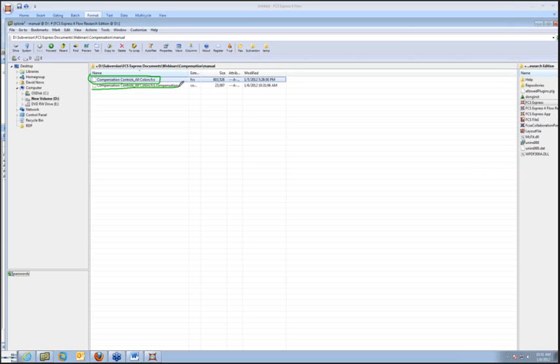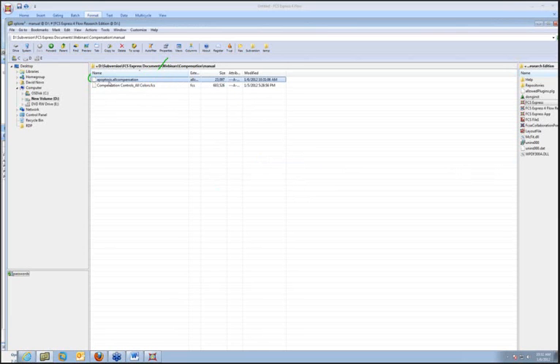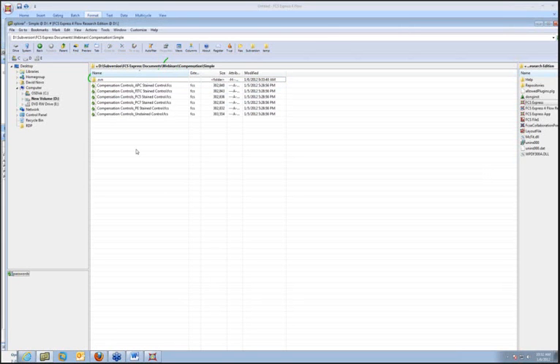Now, one of the things that you can also do with a slight change is if you take this data file and you rename it as .allcompensation, and we can call this my, whatever, apoptosis.allcompensation, what FCS Express will do is any data file that's in the same folder as this allcompensation file will be loaded with that compensation. So for instance, if I copy this file and put it in here, you notice now I have an allcompensation file. When any of these data files are loaded within FCS Express, instead of whatever compensation is with that file, we will use the allcompensation file we have there.